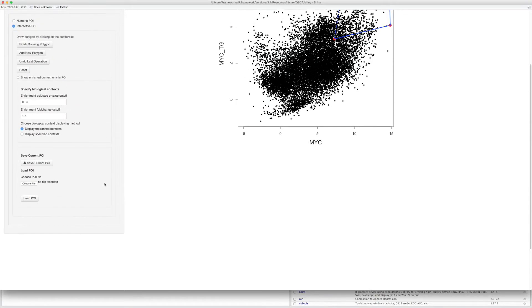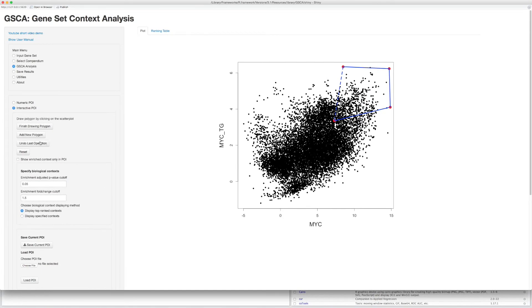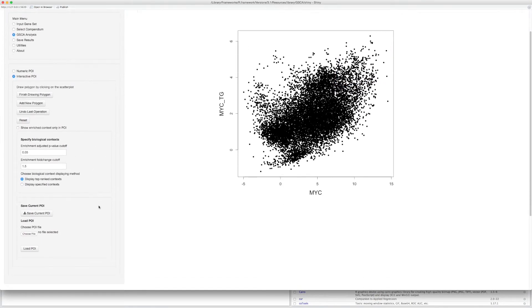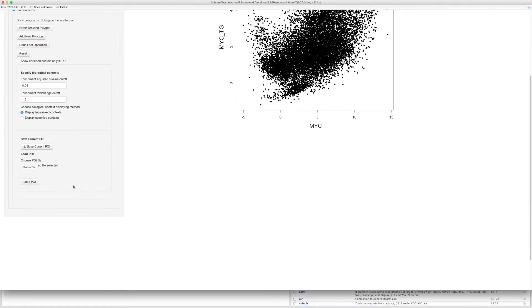When you open GSCA again, you can load the POI file to reload the POI of your last analysis.